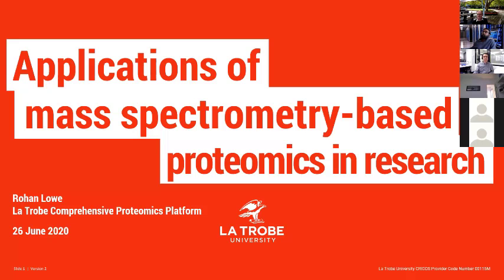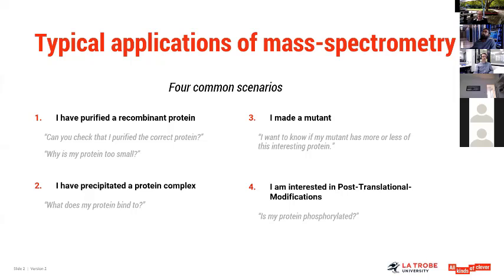So I'm going to cover a few common scenarios for beginners to the platform. And I guess one thing I just realized listening to Pierre's talk was we're about much more than just collecting a sort of typical proteome where you try and collect all of the proteins from a sample. We also do quite targeted stuff, which is actually some of our more common work, especially during the semesters when students are busy in the lab.